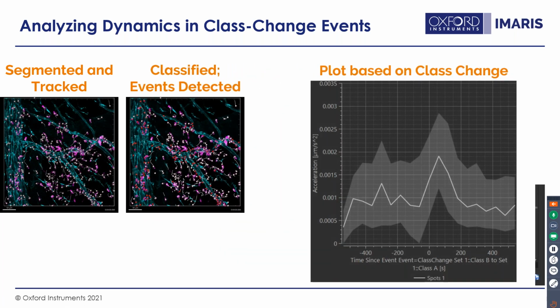Once you've done that, you can move over and automatically see this plot available to you within the Vantage view. In this case, we've synchronized all of the portions of the track where you see the event that contact has happened. We've taken all of those portions of the track and we're looking at them as a group.